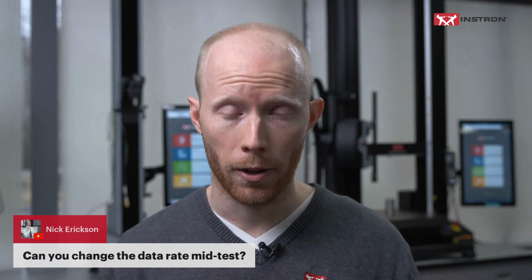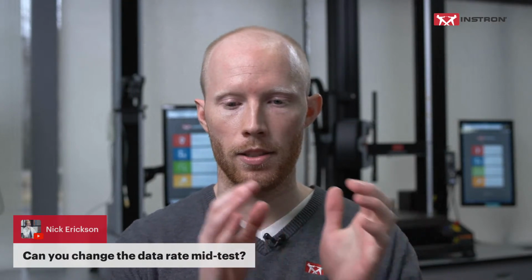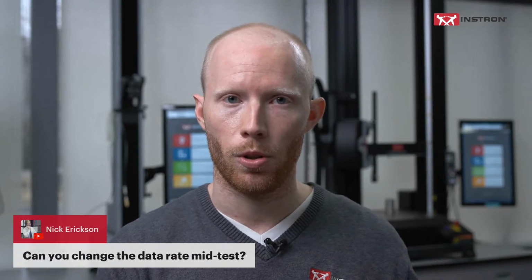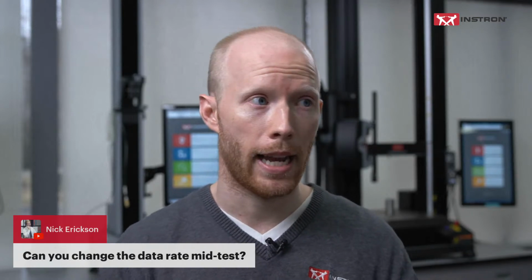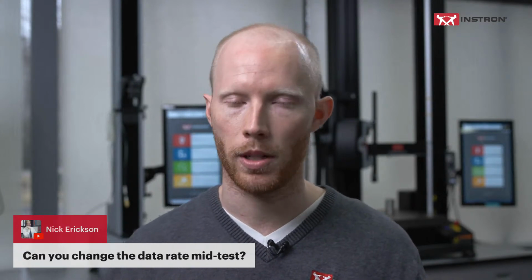Another way of doing it is if you have our test profiler module. It's a purchasable add-on for Bluehill Universal. With the test profiler, you create a series of blocks, different sequences where you're doing different machine control in each of those steps. In each step, you can specify if you want to capture any data, if you want to capture at a certain rate, at the default, or at a custom rate.